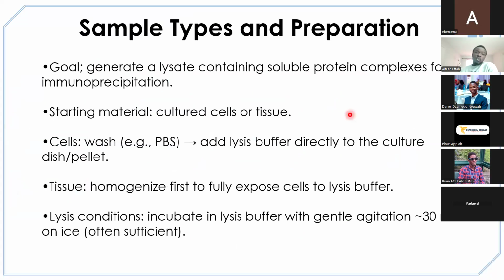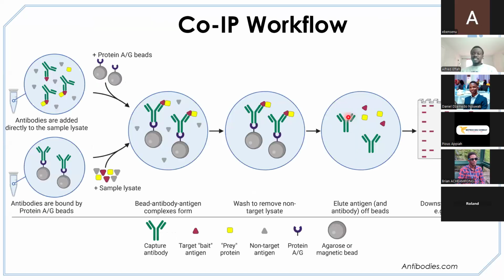So one key thing we are also interested in, this is an interaction between two different proteins. And so the main goal is to ensure that the complex is there. The protein-protein complex is there. The interaction is not interrupted. Now, once we disrupt the interaction between the two proteins that are interacting, we are not going to see the interacting partner here. So we want to make sure that this interaction, the bond between protein A and then X, should be maintained throughout our system, so that in the end we can visualize.